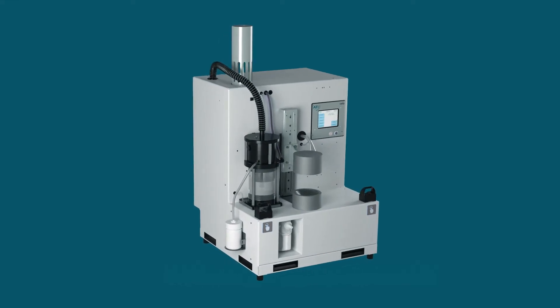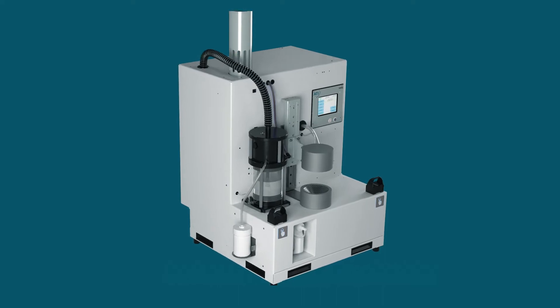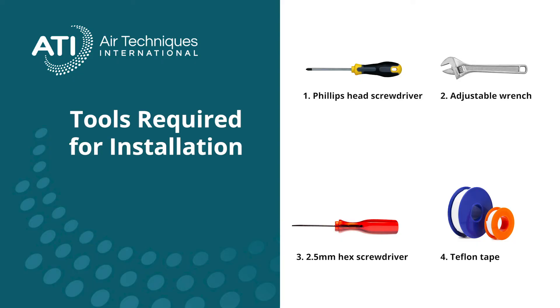Congratulations on the purchase of your new 100X. After removing the 100X from its box, place it on a sturdy table or optional base cabinet. The following tools are required for the installation.